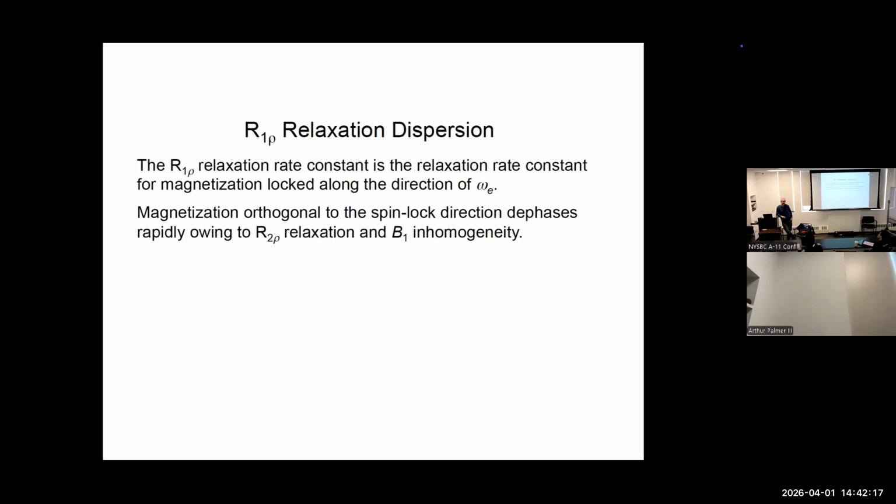In fact, we once wasted a lot of time trying to measure it. But the slow decay, there are approximations for it. Because looking for slow decay means that the negative eigenvalue is close to zero. And now there are approximations.